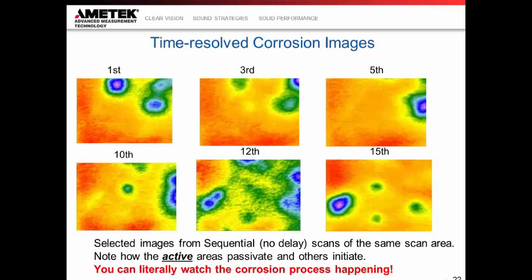And this is a powerful representation to other members of your team to demonstrate how this is happening, how this changes throughout the course of exposure time, and how many pits do I have, and which ones are the most intense, because then we can take this information and use it with some optical measurements to determine the size and number of pits, and we can use this to determine their intensity.